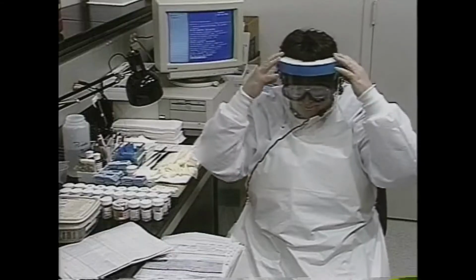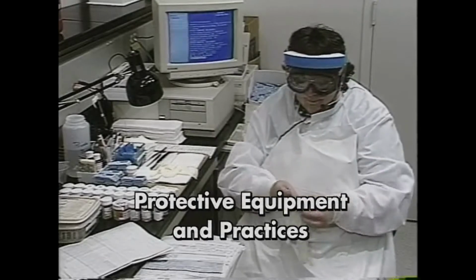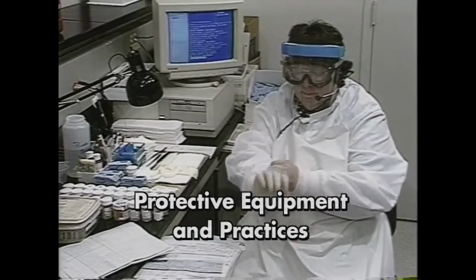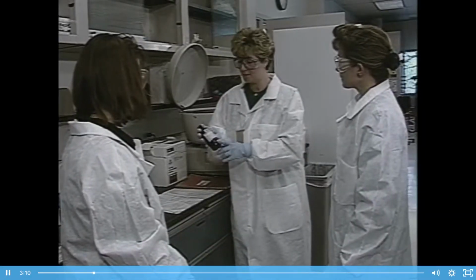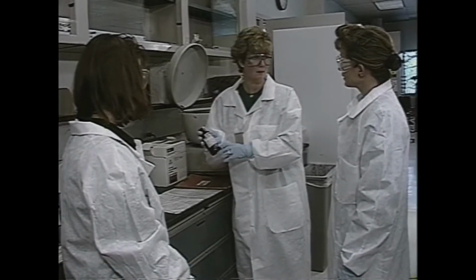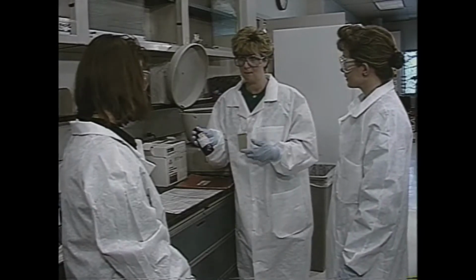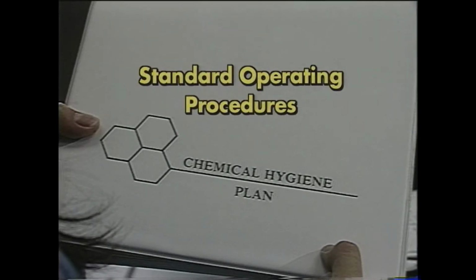A laboratory must also have protective equipment and practices available and in use to minimize employees' exposure to hazardous chemicals. Your facility's chemical hygiene officer can answer questions about working with hazardous chemicals in a laboratory environment and the details of your facility's chemical hygiene plan. Among other things, the chemical hygiene plan outlines the standard operating procedures you should follow when working with chemicals.